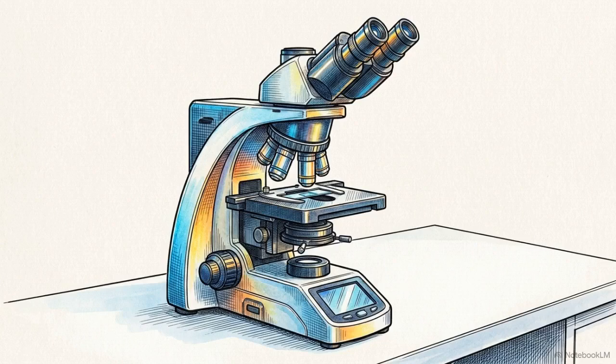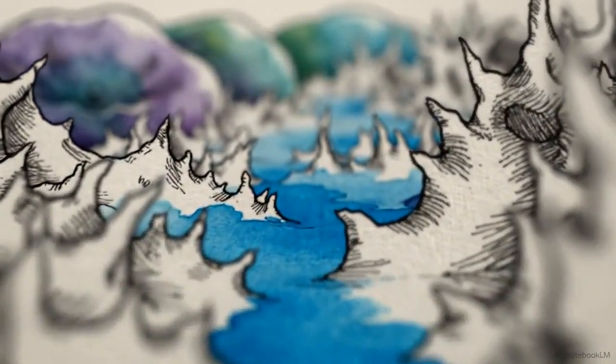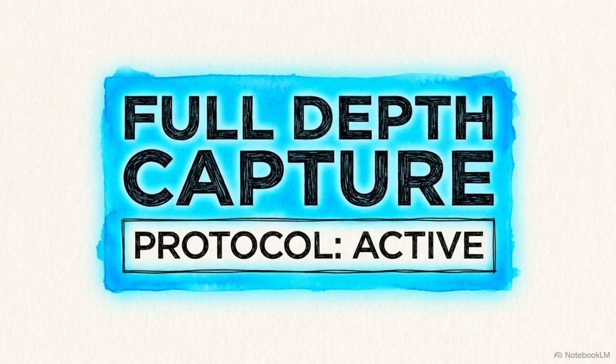High-power microscopy operates with a strict physical limit. When observing complex structures, you are restricted to a razor-thin focal plane, leaving the immediate foreground and background entirely out of focus. The solution to capturing the entire structure is the Extended Focus Image, or EFI protocol.